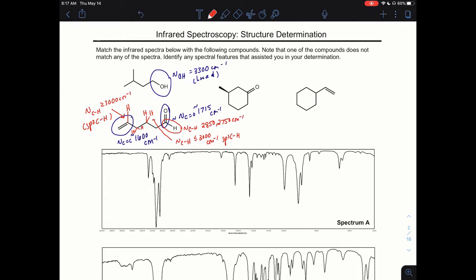Now the rest of the molecules are pretty boring. After that discussion about the CH stretches, you might go back to the first alcohol and say you only expect these stretches to be just below 3000 because all we have in this molecule is sp3 carbons and sp3 carbon-hydrogen bonds. Okay, for this molecule, you'll expect the stretching frequency around 1720 from this ketone, and that's really all there is, and then you just have sp3 CHs. So again, the stretching frequency will be just below 3000 wave number.